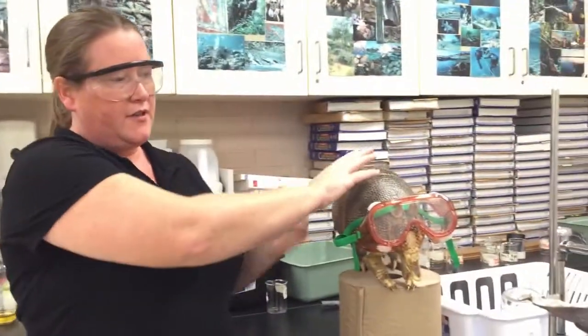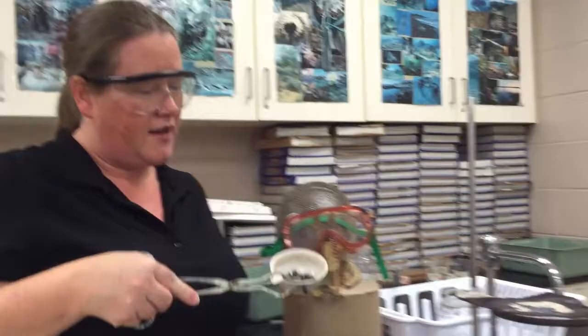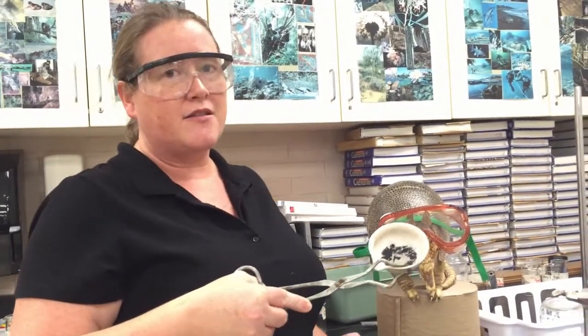This type of reaction is called a synthesis reaction, and it is a copper atom combined with an oxygen atom to produce a compound called copper oxide. So that is a conclusion for what students saw in this portion of the lab. We will be using this copper oxide in another reaction, and that'll be an upcoming installment.